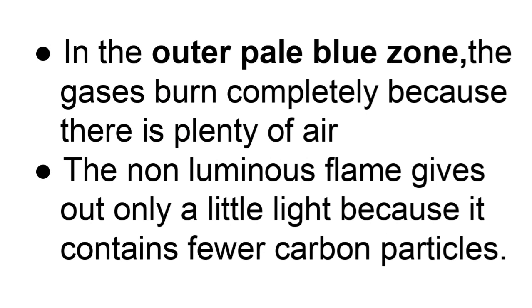So, the fact that the air hole is open means there is sufficient supply of air, and therefore in that particular flame, the non-luminous flame, there is complete burning, apart from in the middle where we have some partial burning, producing the green-blue zone. So very little light is produced, and therefore it is generally blue in color.